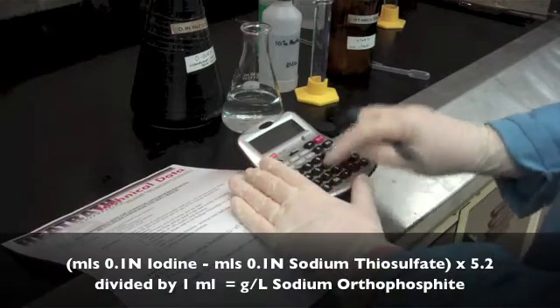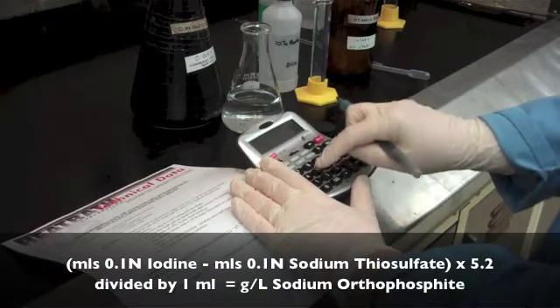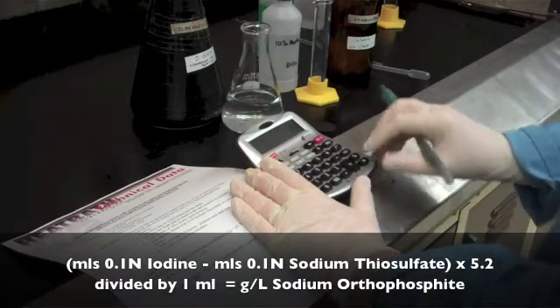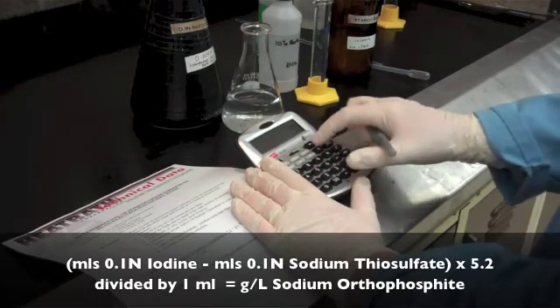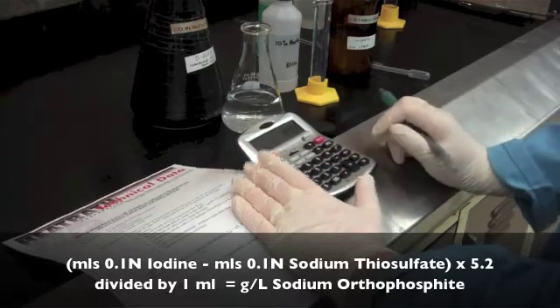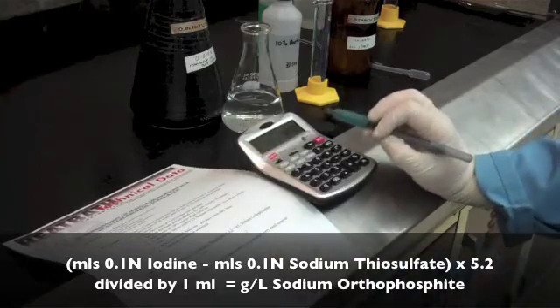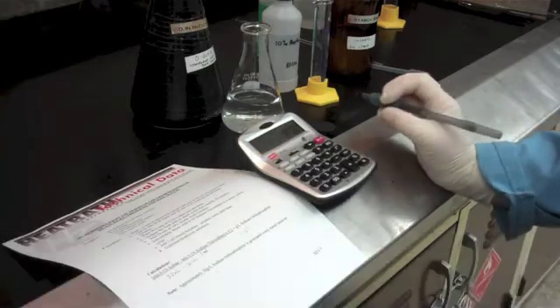So 50 milliliters minus our 12.1 milliliters of sodium thiosulfate times 5.2, divided by our 1 milliliter sample, gives us 197 grams per liter of sodium orthophosphite.